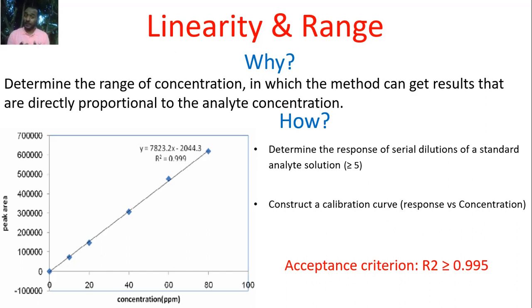But please pay attention to the linearity, because after doing the linearity, if you got any results that are out of the range, for example, you've done a linearity range between 1 and 100 microgram per ml, but during the release study you got one of the samples with concentration 130 microgram per ml.